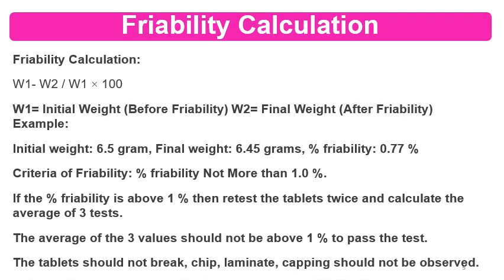Then there is the problem of a formulation type, that is the bilayer tablet. In a bilayer tablet, sometimes layer separation happens during friability. If layer separation happens, friability will also give you variable results.